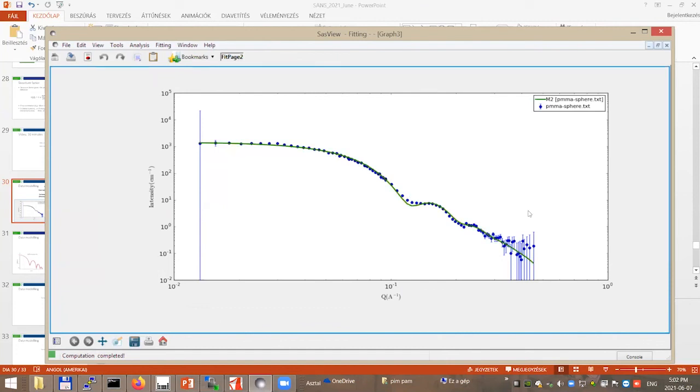So for the conclusion, usually such quality of fits is accepted because it is almost never possible to make a fit which would perfectly match the data. The important thing is that it reproduces the overall structure of the data, and that the parameters have a precision of around 5 or 10%.